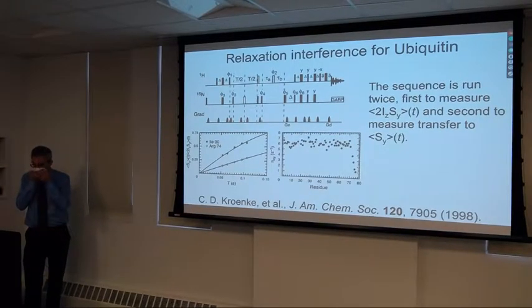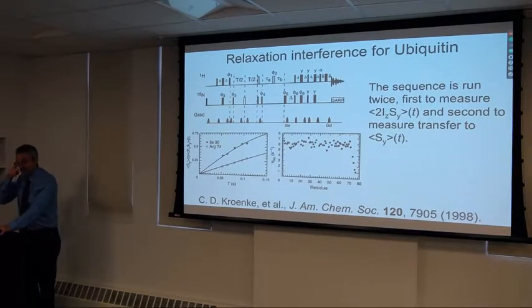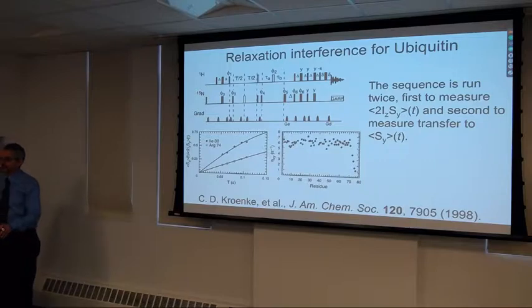So we'll continue from yesterday, and as I said, one of the experiments that's useful because it doesn't depend on chemical exchange broadening measures the transverse relaxation interference constant. This is called eta xy, and it is the difference between the width of the two doublet components in an IS spin system. So this is run most commonly for the N15 amide group in proteins.